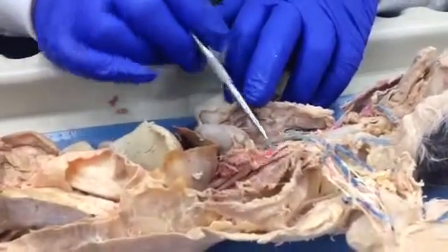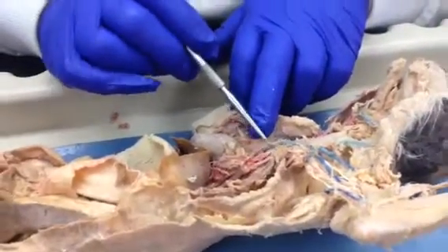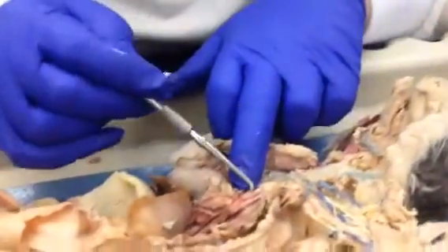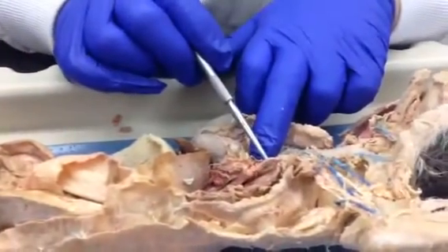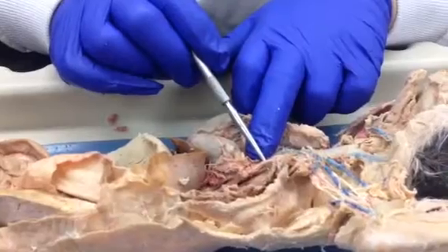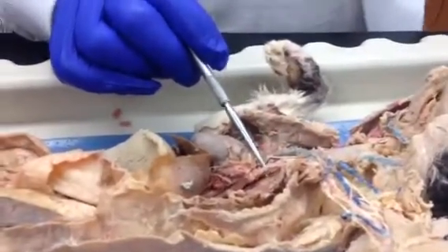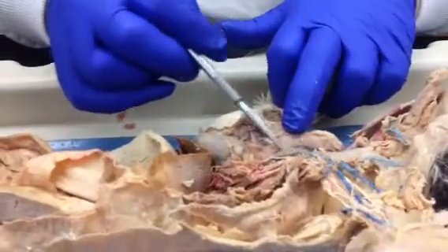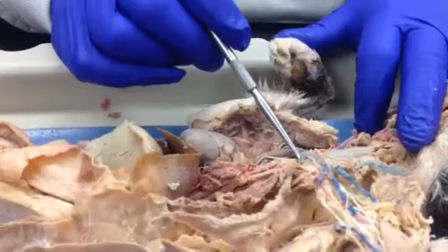The cat only has two. There's the vagus nerve right there. So we have the brachiocephalic and the left subclavian. Now again, left or right doesn't usually count unless there's a difference. Like this one, as I said, the left subclavian as opposed to the right subclavian, which is going to be over here. So again, the left subclavian. Then we're going to follow the branches of the left subclavian.